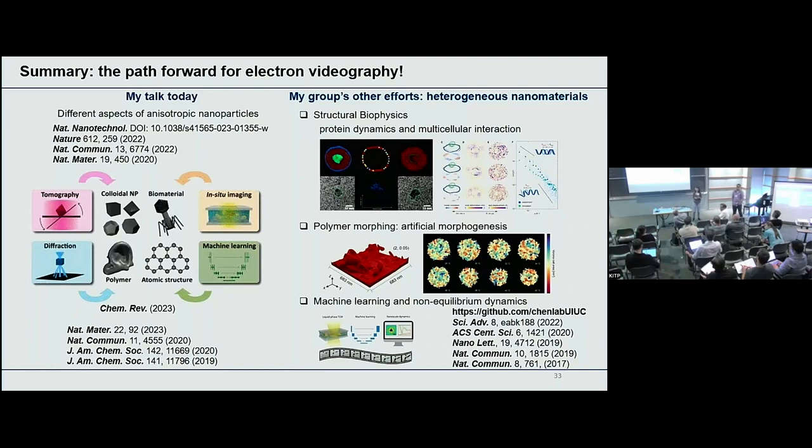Impressive. And if I may, could you make the channel tapered? Tapered. So by tapered channel, you mean you have different thickness of the liquid? Yeah, or a large inlet and a narrow outlet. Yeah. That's completely engineerable. This microfabricated chamber is really utilizing microfabrication to design the chamber. So basically, the only limitation is how one can do lithography on those chips. Splendid. Thank you.